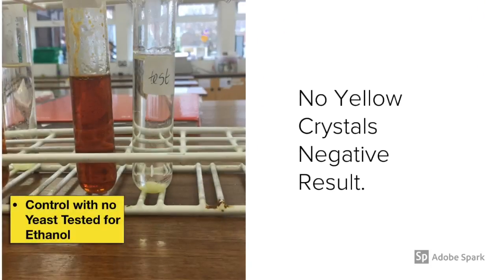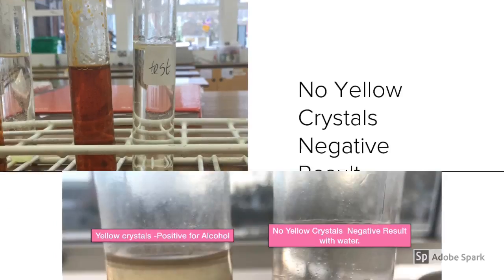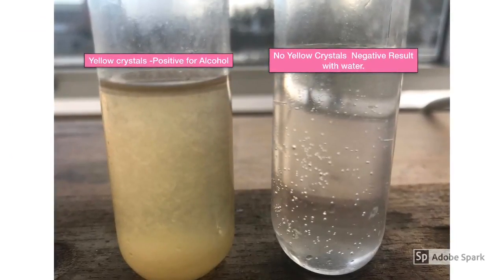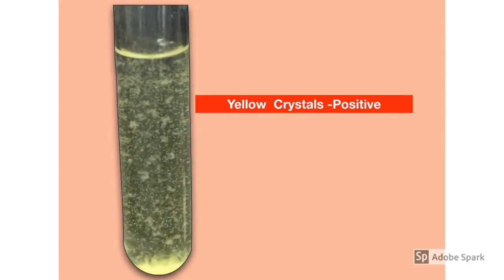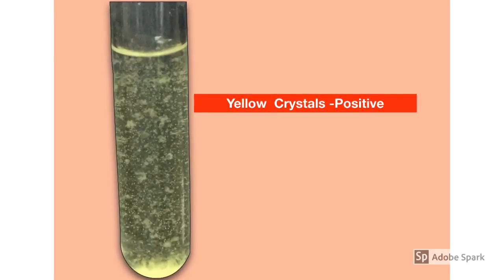In the control there were no yellow crystals produced, so this is a negative result for ethanol. We also conducted the same test using a sample of water, and you can see here on the right that no yellow crystals were produced. The formation of yellow crystals indicates a positive result for ethanol, and this was only achieved in the flask that had contained the yeast cells.